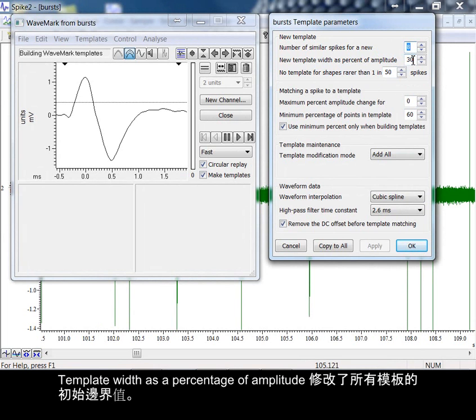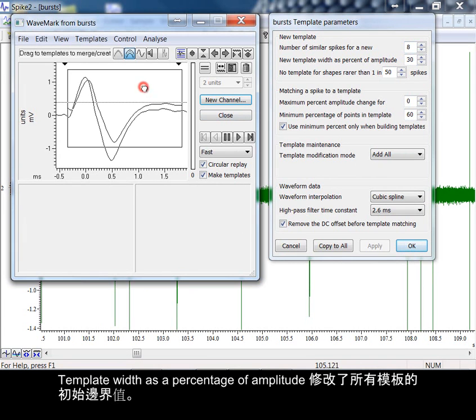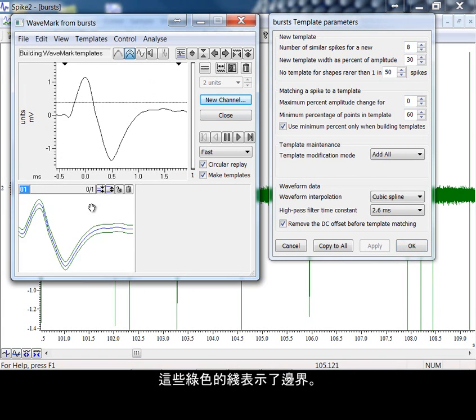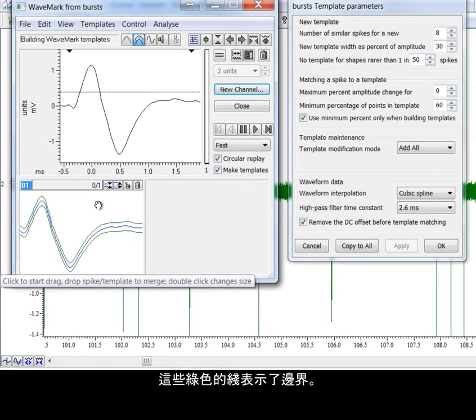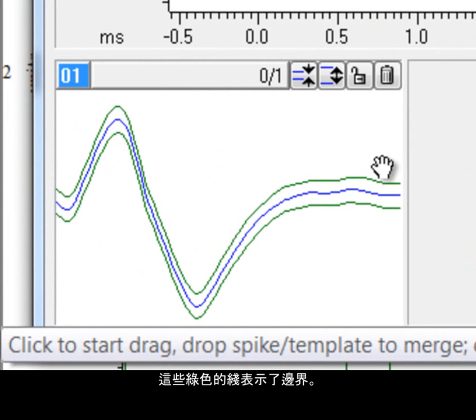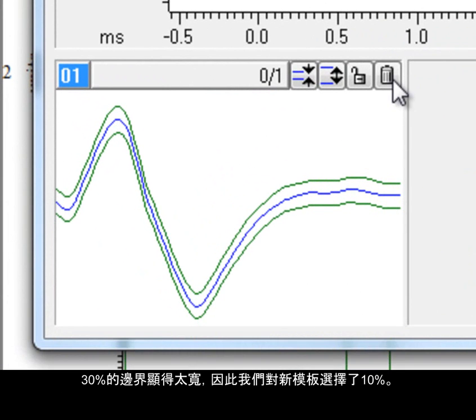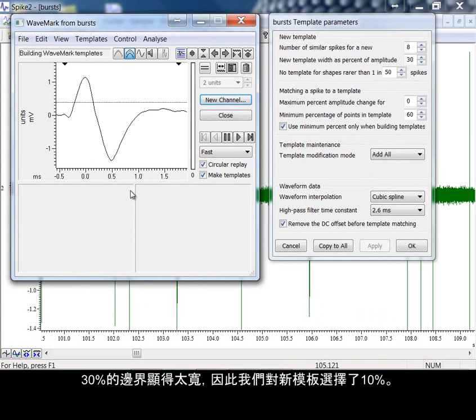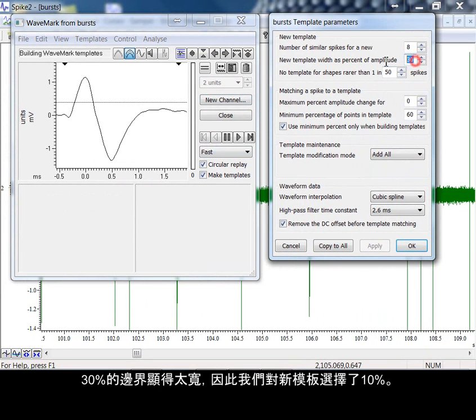Template width as a percentage of amplitude modifies the initial boundaries or limits of all templates. The lines shown here in green indicate those limits. At 30% the boundaries seem quite wide, so let's try 10% and apply it to new templates.